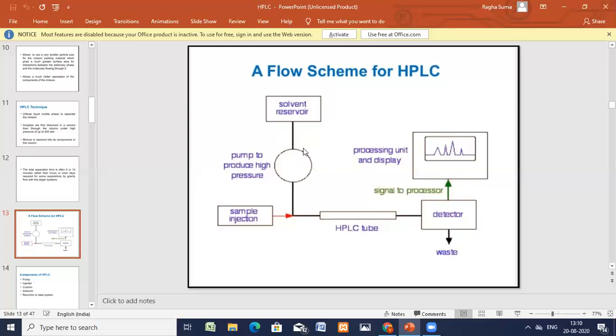This technique can be extended to separation systems employed in different types of other liquid chromatography methods: adsorption, partition, ion exchange methods, and gel exclusion.